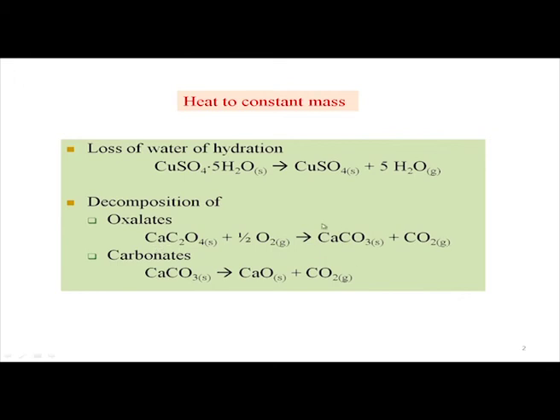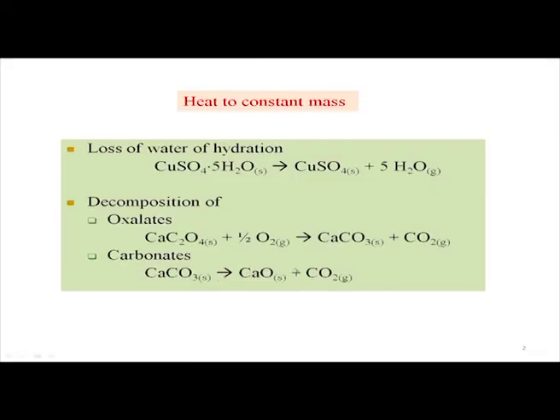So, this gives a very important piece of information to us, because in detail we will talk in our next class about the degradation not only for your calcium oxalate, but for the magnesium oxalate also, and that degradation process will also tell us about the corresponding stability of these two important compounds, because many bivalent metal ions can give you the carbonates.